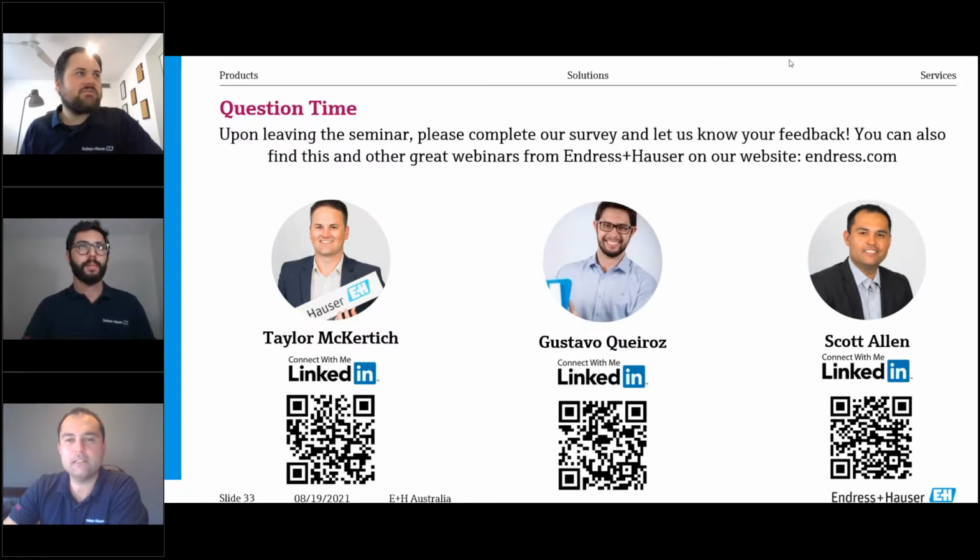We've got another question for you, Gustavo. This is from Gary. He's asking, can the device be programmed to only transmit changes in readings, so date, time, and new reading? I guess that might be for a remote application, but do you have any insights on that? The measurement itself will be held in a constant way. What we can do is the transmitters have logbooks available, so you can keep track and monitor, and you can set specific alarms. And if you combine the transmitter with an edge device in a cloud solution environment, you can trigger, for example, a notification if there is a change higher than a specific value. Yeah, it's possible.